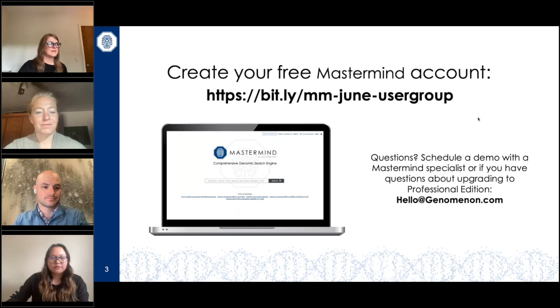Okay, great. Next question, let's see. Can you search by genomic coordinate? I'm not sure if we covered that yet. Yeah, I think there's a couple ways to take in that question and answer it. So Denise covered, can you search by genomic coordinate for, say, deletion CNVs? Yes, absolutely. I spoke to the fact that, yes, you can search by genomic coordinate if you want to search a singular change based on genomic information. Both of those, as Denise had highlighted, you can find more information in the FAQ. So that will give you the exact formatting of any of that type of information.